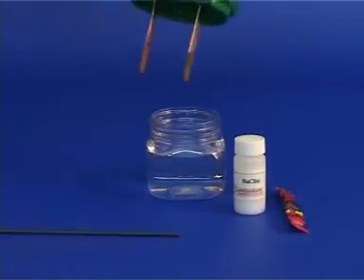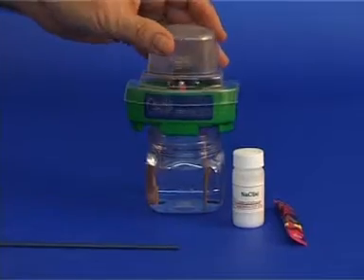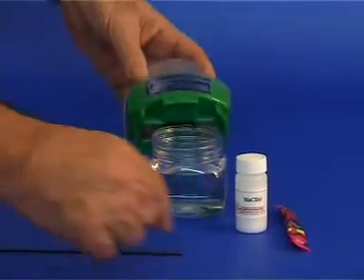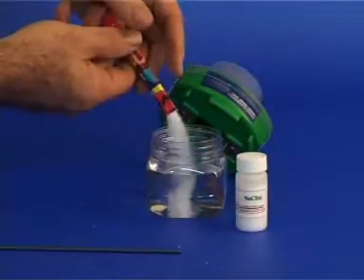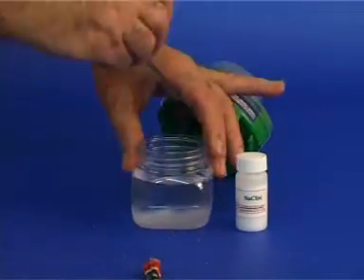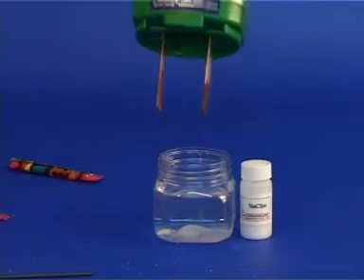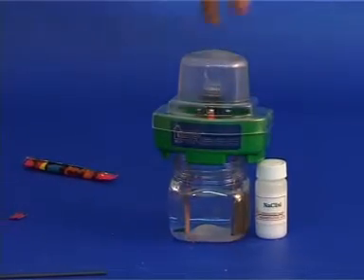First we will measure the conductivity of tap water. Observe that the bulb does not light up. Next, let us mix in the sugar and measure the conductivity. Observe that there is no change from the tap water.